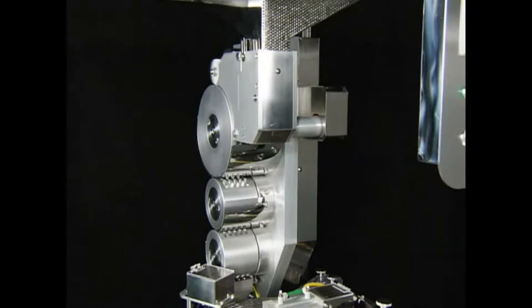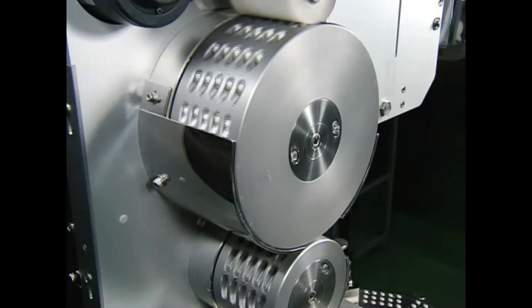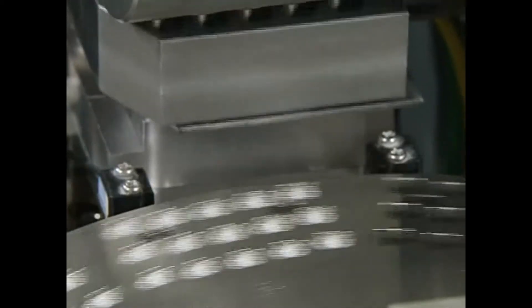Empty capsules are loaded into the hopper and Qualacap's own unique transport system orients and transports them to the separation disc. This system was developed by Qualacap's and has been patented in 10 countries.